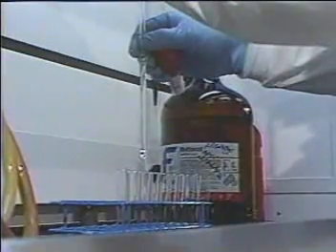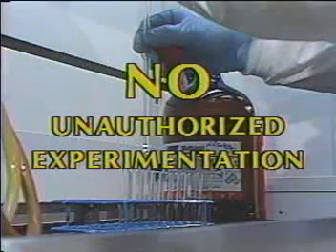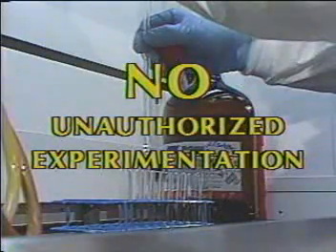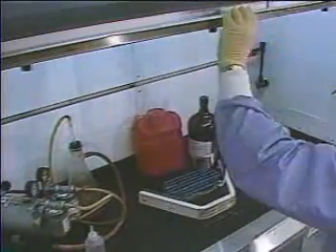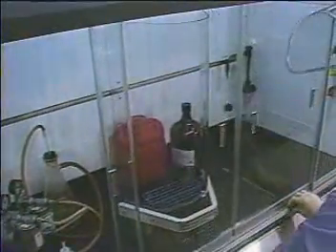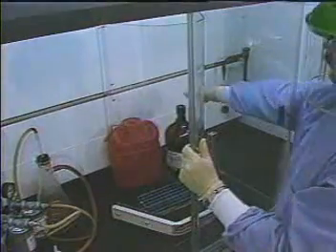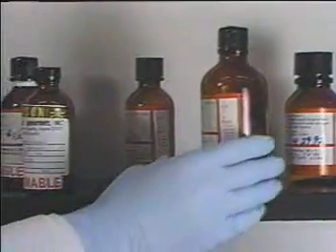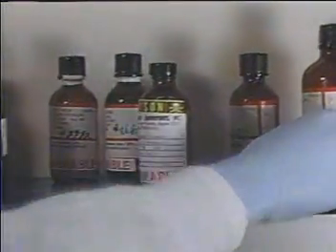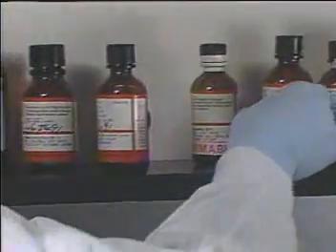Use the smallest amounts possible to attain the desired reaction. Never involve yourself in unauthorized experimentation. If there's a potential for explosion, place your equipment behind a shield. Wear a face shield and appropriate gloves. A lab coat made from a slow-burning material is also necessary. Plastic is not recommended. Make frequent checks of stored containers. Look for evidence of corrosion or contamination. Push containers back from shelf edges.